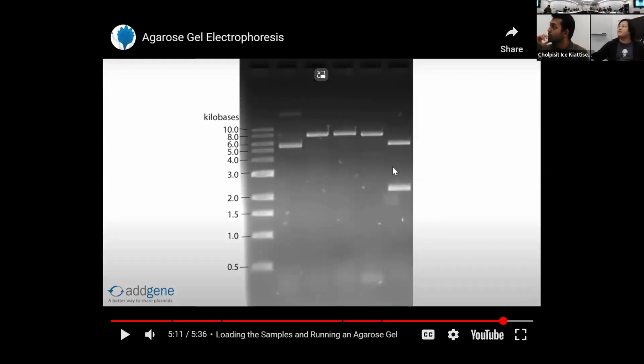Yeah, this is very cool. And the final thing I want to say for the gel is that the DNA doesn't have color. So we usually use some kind of molecules that attach to the DNA and make them shine under the light. Most of the time we use a fluorescent dye that binds to the DNA, and it will shine once you give it blue light.